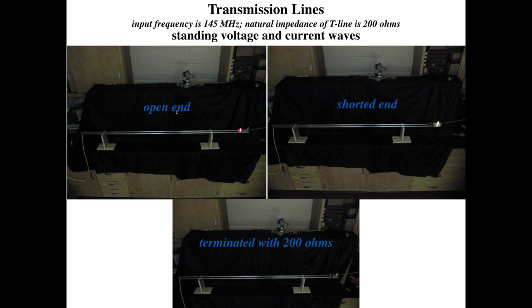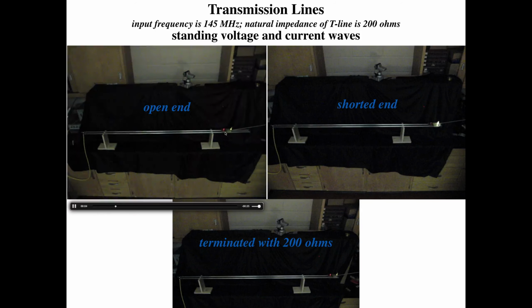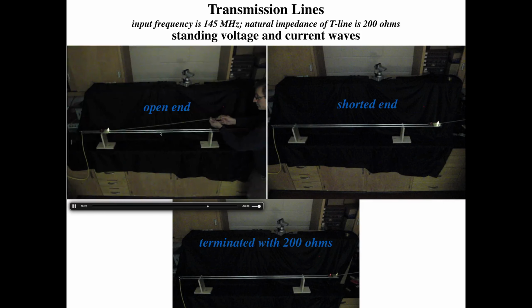Over here is the open-ended transmission line, and now you can see the whole transmission line, including the coaxial cable that's feeding in the 145 megahertz from the synthesizer back here. So this is the open-ended. We start off with voltage high, current low, and let's see what happens as we move down the line. We can see the voltage starts to drop, current starts to come on. As we keep moving, we'll see that the voltage starts to pick up again, and the current will start to drop. Okay, and we'll continue on. You'll see the voltage drops, and then the current picks up. In other words, you can imagine there's a sinusoidal pattern of voltage and current along this transmission line, and it tells us that the impedance along the transmission line is varying as well. In other words, it depends on the position.